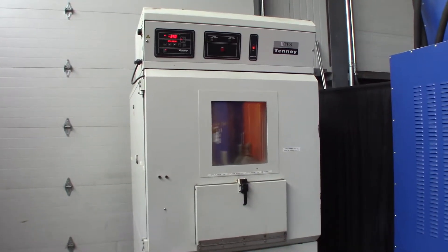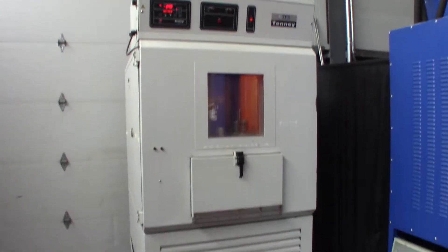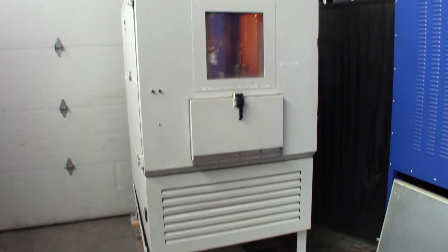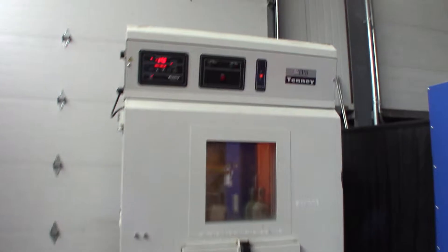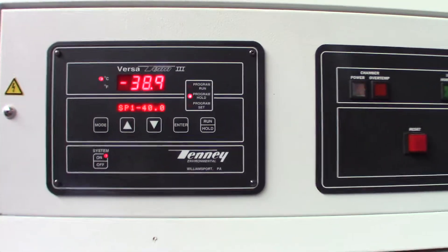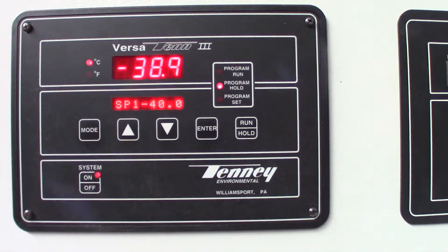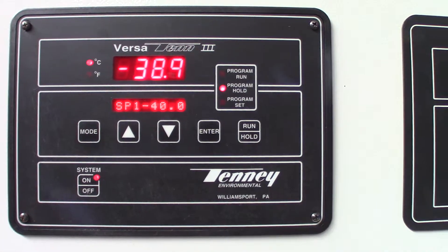Here we have the Tenney T30RS environmental chamber. We turned this on about two hours ago and it's running in refrigeration mode. The set point is negative 40 and it's at negative 38.9 right now.